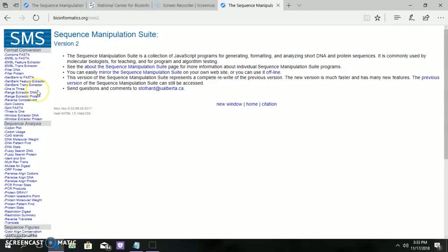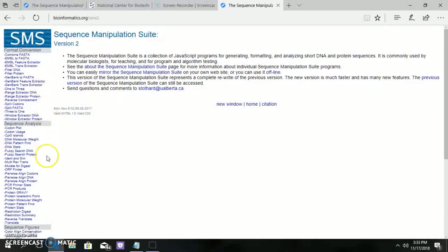This version is much faster and has new features. Here on the left side of the page, you can see many parameters for nucleotide and protein analysis.